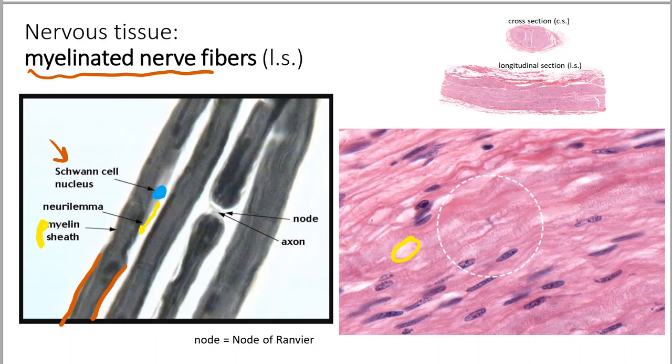And we can see some of that myelin over here. These white spaces are areas of myelin. And then there's a perfect little node. I've drawn your attention down here; node means node of Ranvier. This is where you can see the Schwann cell wrapping around the axon of a neuron cell body, page 253. Page 253 of your lab manual has a really nice description of what the myelin sheath gaps are. And this area right here is an area of a myelin sheath gap.